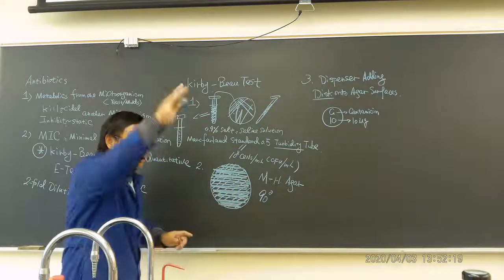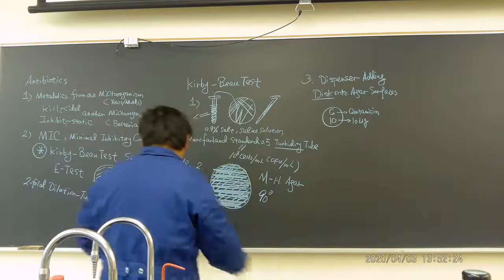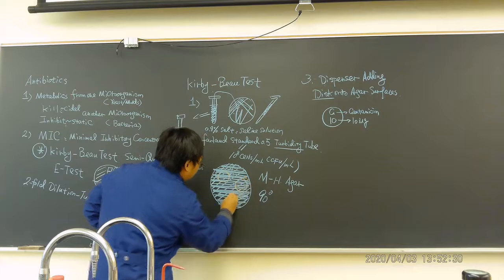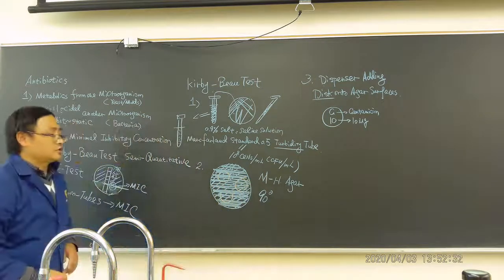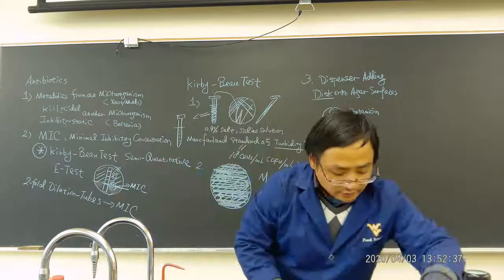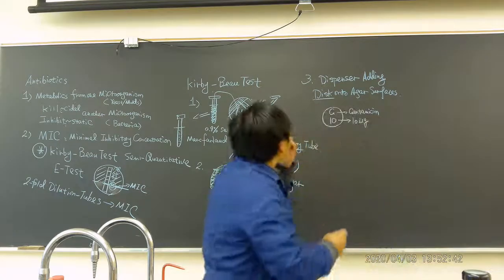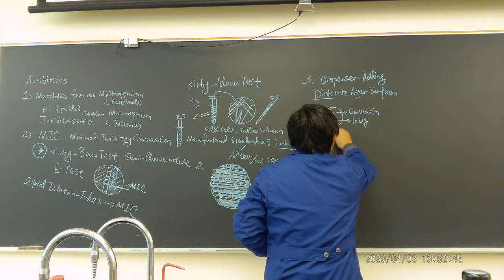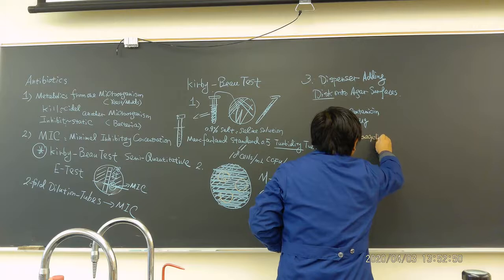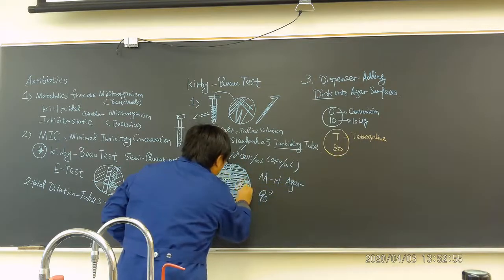You press a button. I'll show you real quick. Then we add it there. Therefore, you will have so many. Let's say out of 3, okay? These discs there. Let's say we have a G10. That's gentamicin. The second one we're going to have is tetracycline. That is 30. Okay. Then we have T30. 30 is a concentration.